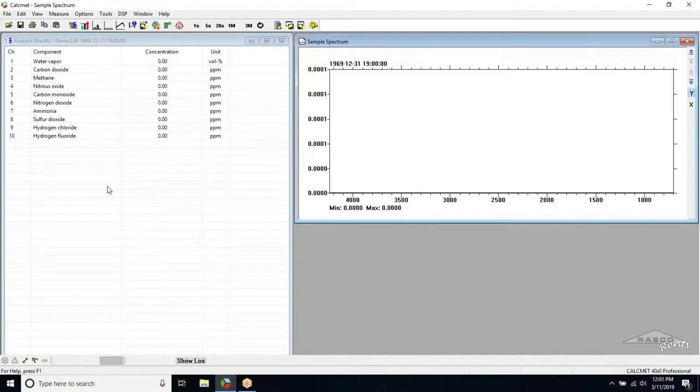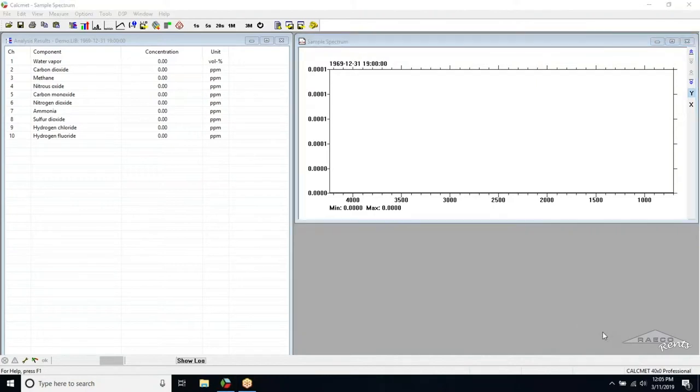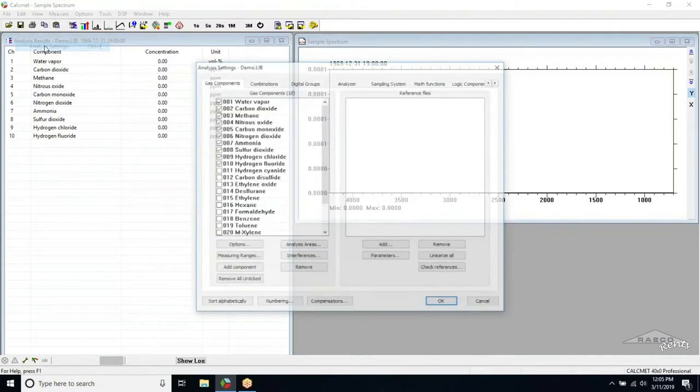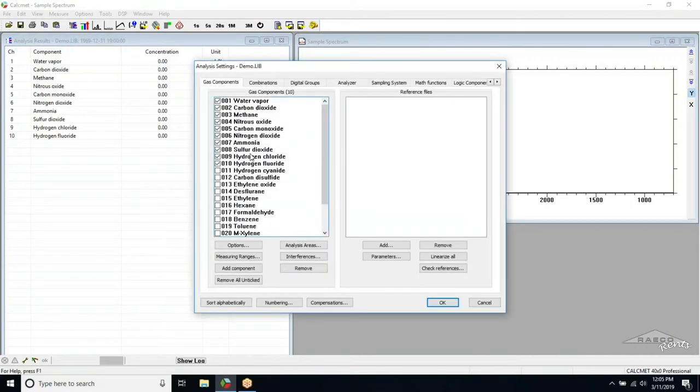The default library contains only 25 gases, however the extended library contains over 300. To add a new gas to the library, we need to go back into Edit and then Analysis Settings. Then press the Add Component button.